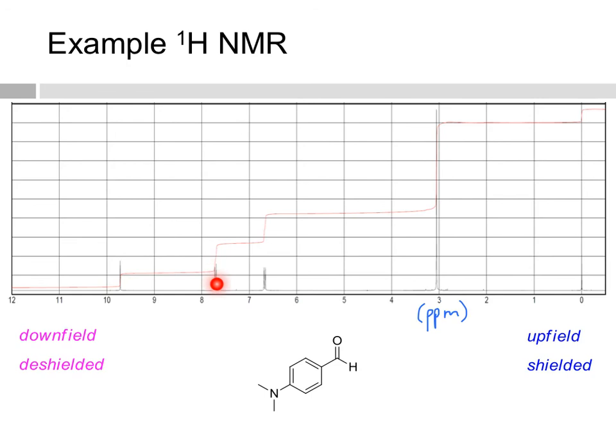Each of these peaks corresponds to a set of equivalent protons, and each signal also has a different pattern. For instance, this peak around 9.6 ppm is a singlet, whereas these two peaks are divided into two peaks each and are called doublets. So a proton NMR provides far more information than just chemical shift. The chemical shift provides information about the local environment of a proton, while each of these signals also provides information on its neighbors as well as how many equivalent protons there are.